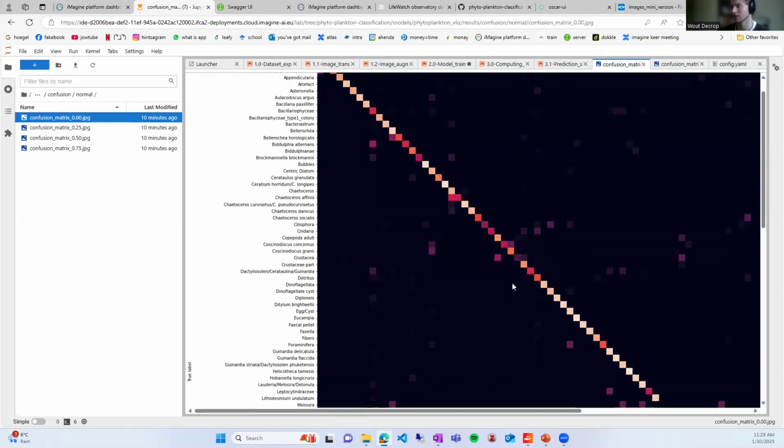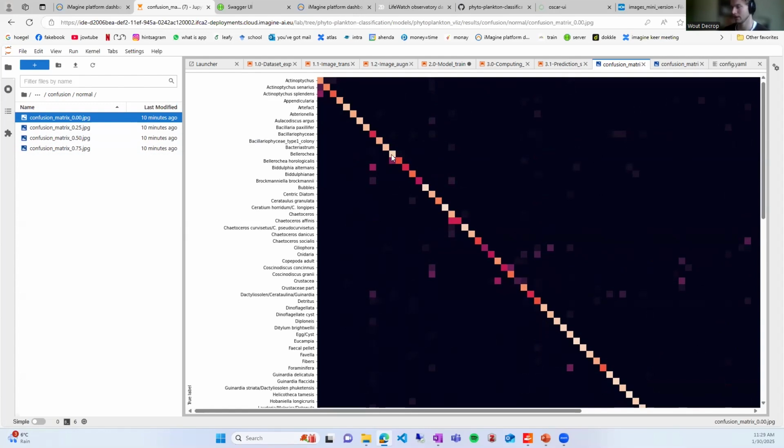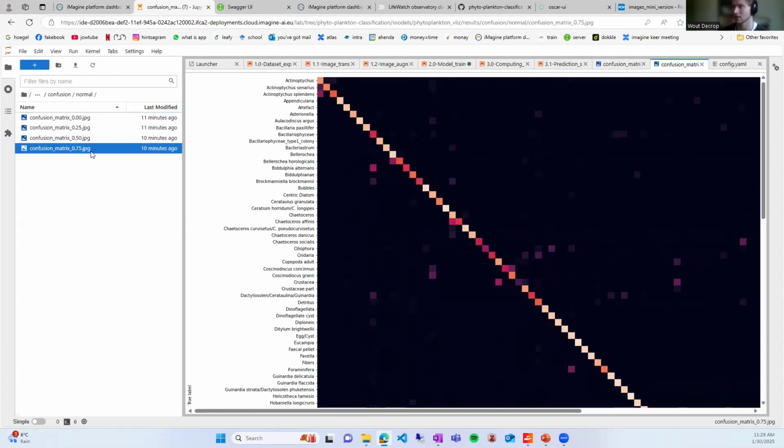And you can see we get a very nice diagonal. But if we put a filter by saying, hey, let's only show the data where we're at least 75% confident, so data where we're kind of split between 2 classes or 3, then we remove those data, or we don't show them in the confusion matrix. You can see that some of the misclassifications get filtered out because I wasn't so confident about them, and in the end they weren't right. So here we get our confusion matrix with a little bit better performance.